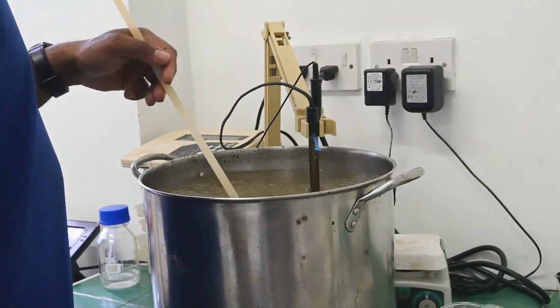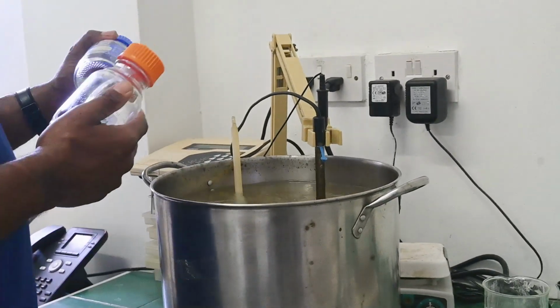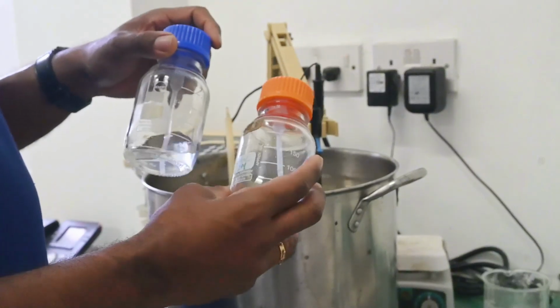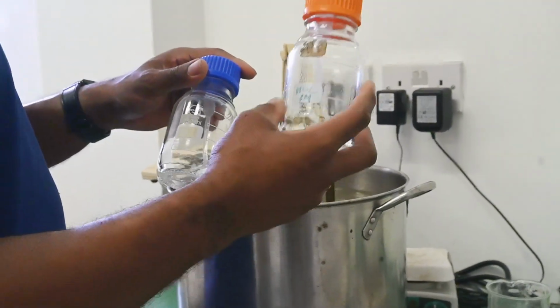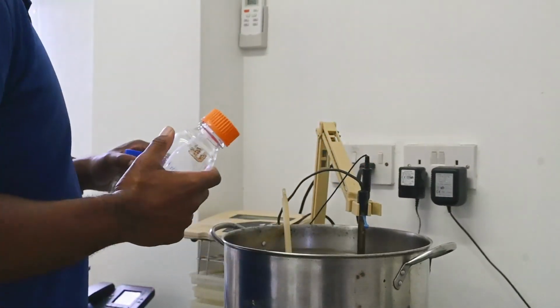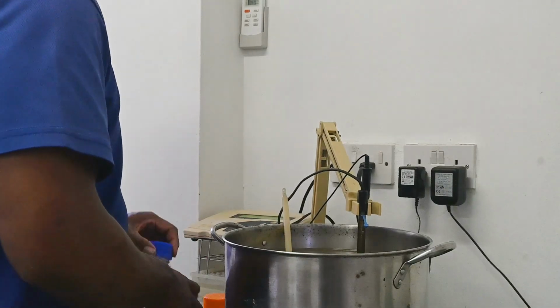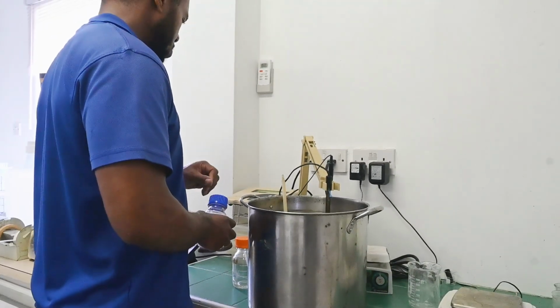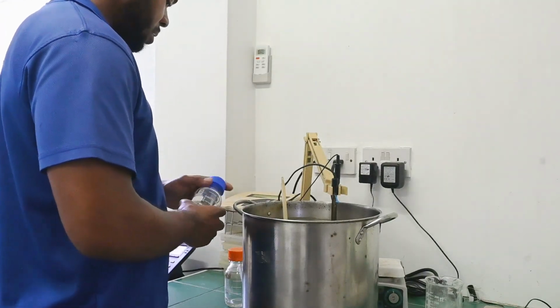So now we begin the process of checking the pH. We use hydrochloric acid and sodium hydroxide. HCl will lower, sodium hydroxide will raise. So our reading on the pH meter stands at 6.03. We have to bring it down to 5.7.